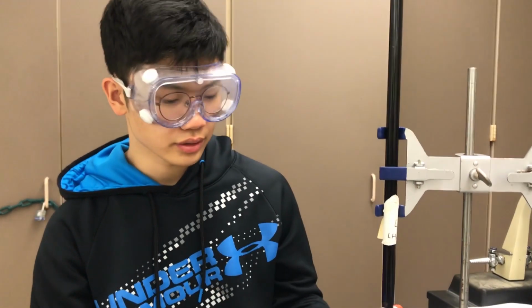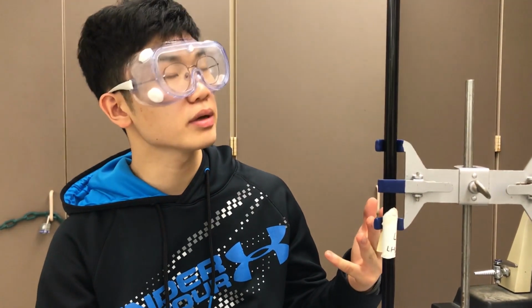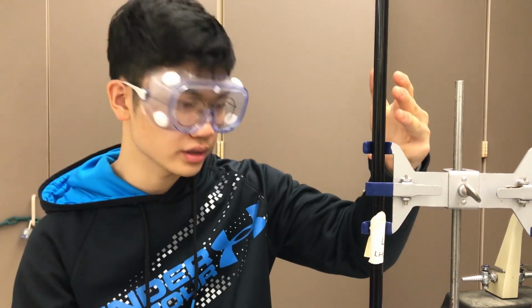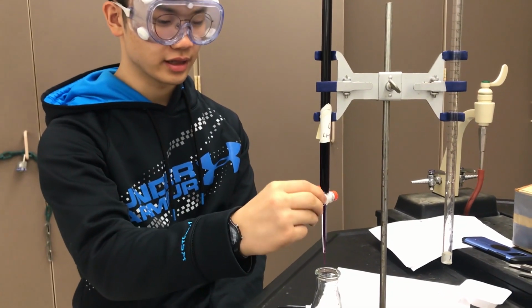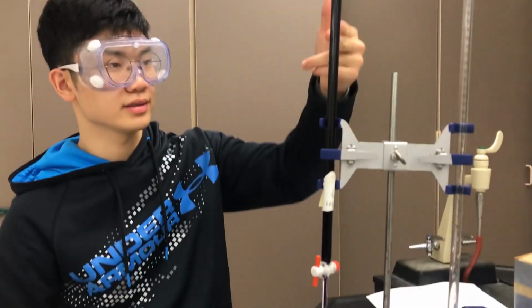So for this solution, we know that we need about 30 milliliters of stock solution. So we can go through about 25 milliliters very quickly without having to worry about it turning dark pink. So just turn the stopcock and let it run until this goes down about 25.